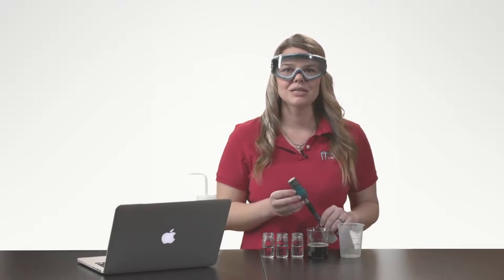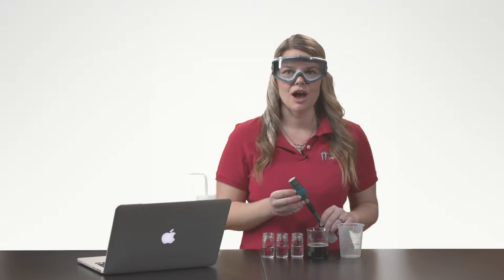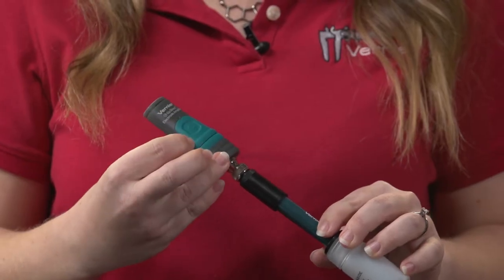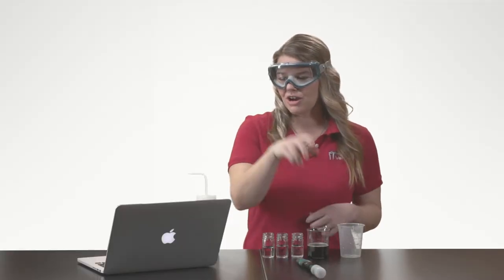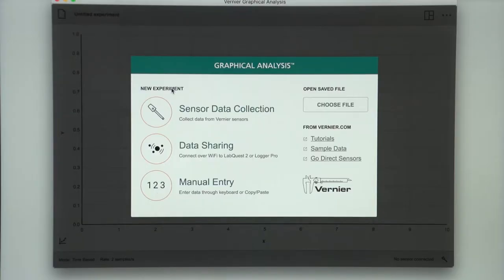Since I will be taking data via Bluetooth, I will first turn on my pH sensor. Then I will launch the Graphical Analysis 4 app and select Sensor Data Collection.